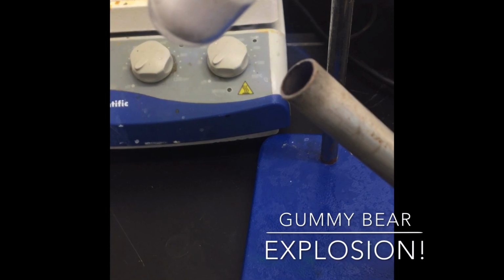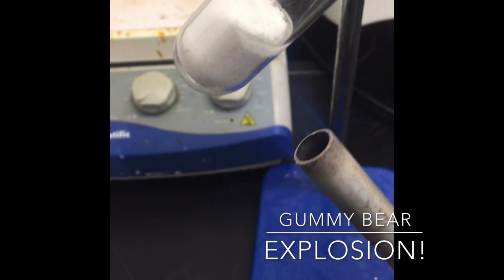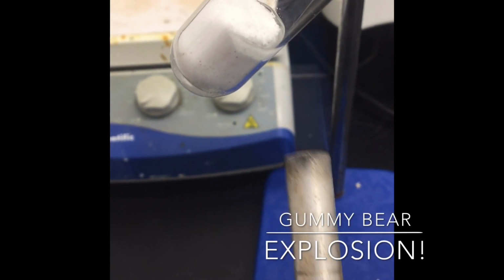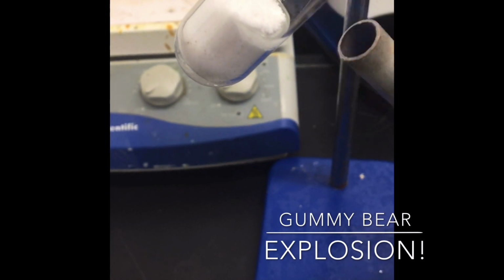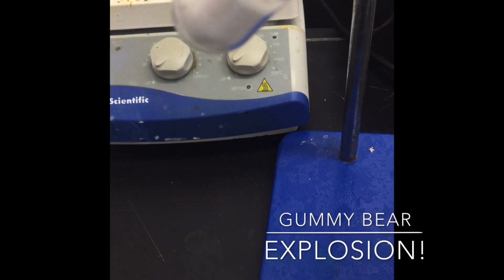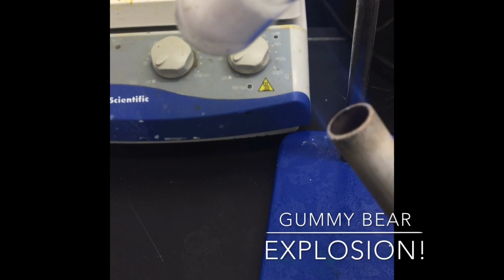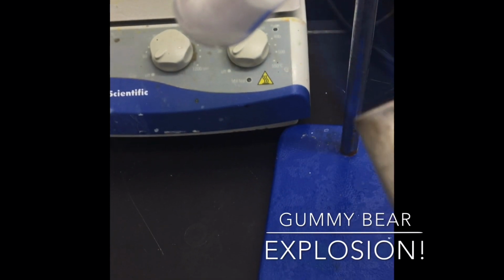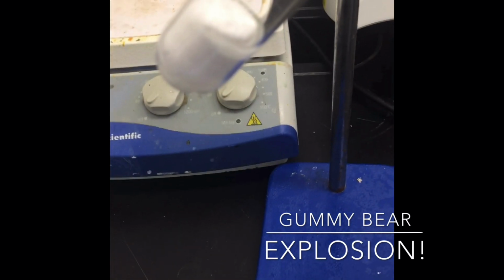And you can see how it's already turning into liquid. Hopefully you can see that. But we have a lot, about 5 grams. And you can see that I am trying to heat evenly everywhere to make sure that it all melts together.